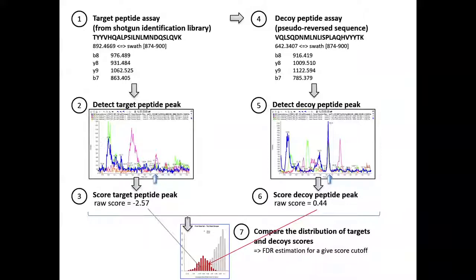That's a distraction for the signal, and we found that with shuffling this actually happens surprisingly often. You have poly A peptides or something, and shuffling them around doesn't help that much. So in our decoy generator, there's a check to see if the decoy looks too much like the target, and you can kick it out if you want. But I think what Biognosys are doing is flipping glycines and arginines, which moves the whole precursor mass, and that's also an interesting idea. So I don't think it's totally resolved. It can still cause problems.